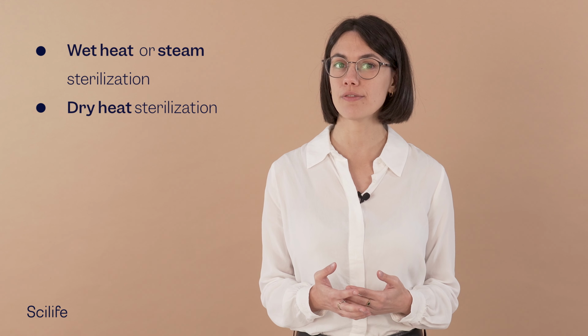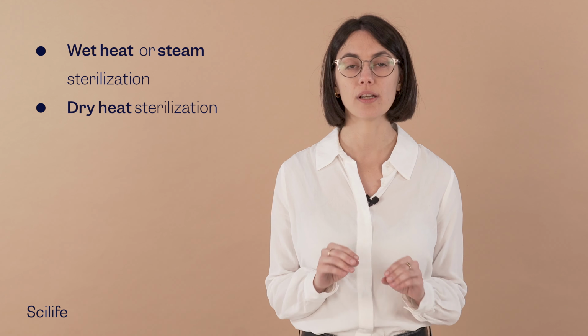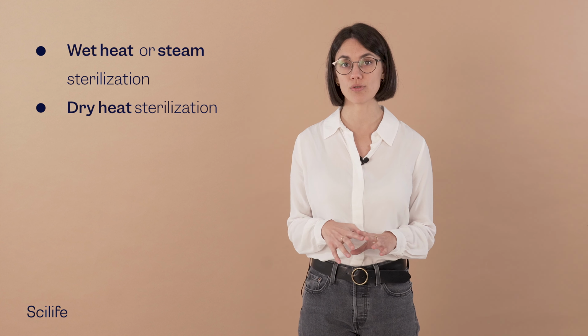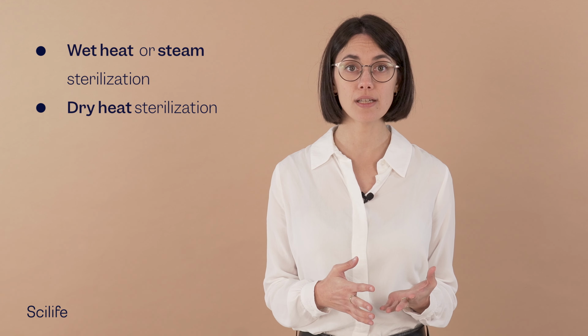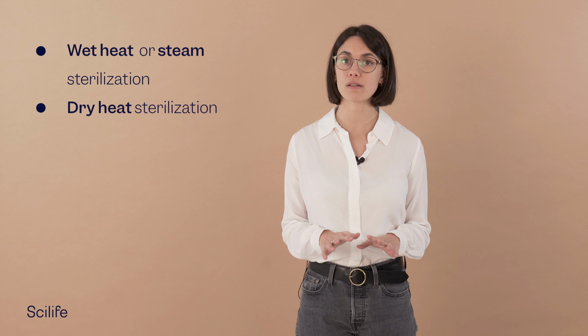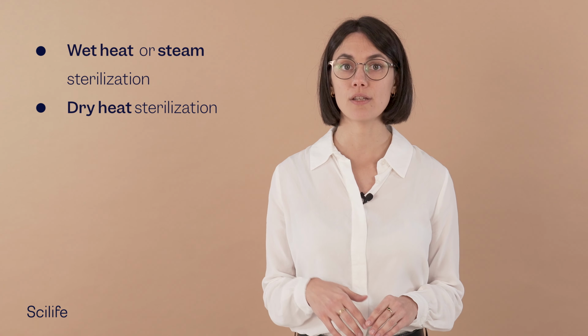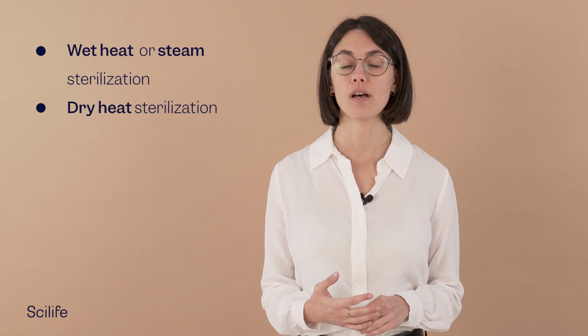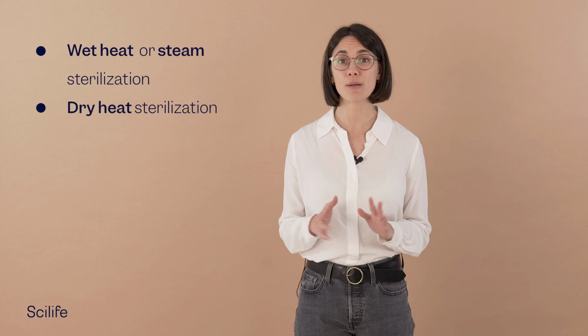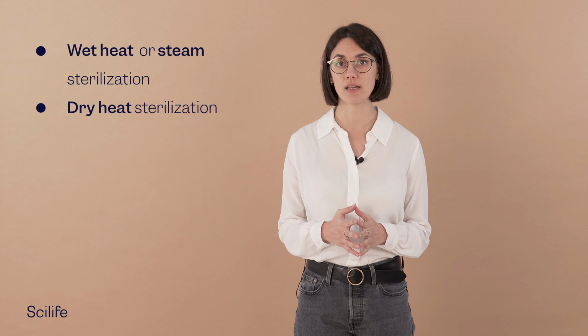Is there another benefit to using dry heat? Sure, it keeps materials dry post-sterilization, which prevents corrosion. Is there a disadvantage to dry heat? Unfortunately, yes. The process with dry heat is very slow and difficult to control. In order to kill resistant spores, longer exposure times are necessary. It is 10 times less efficient than steam sterilization.